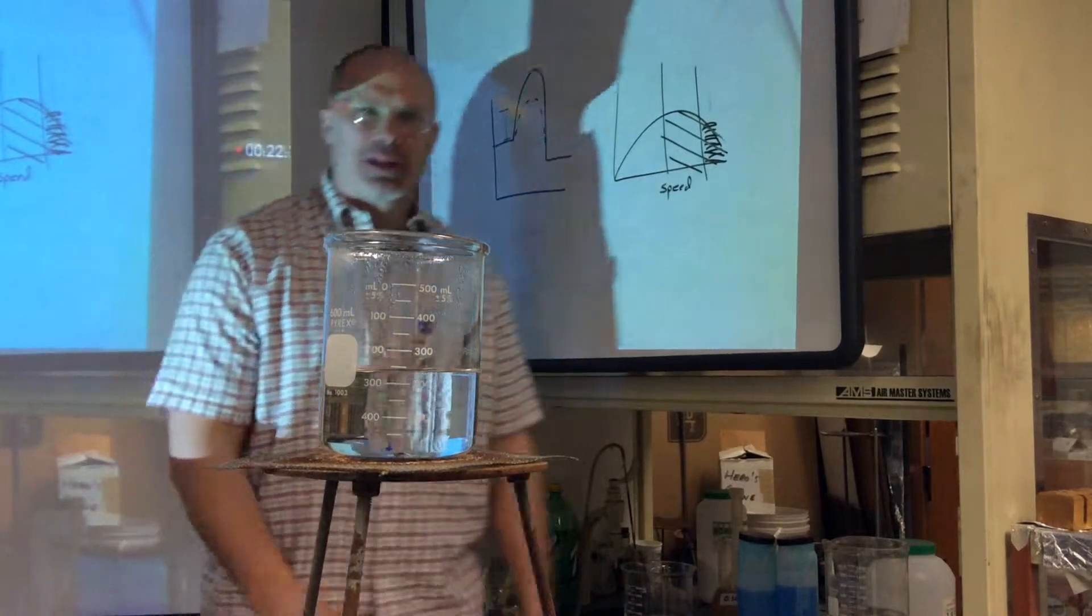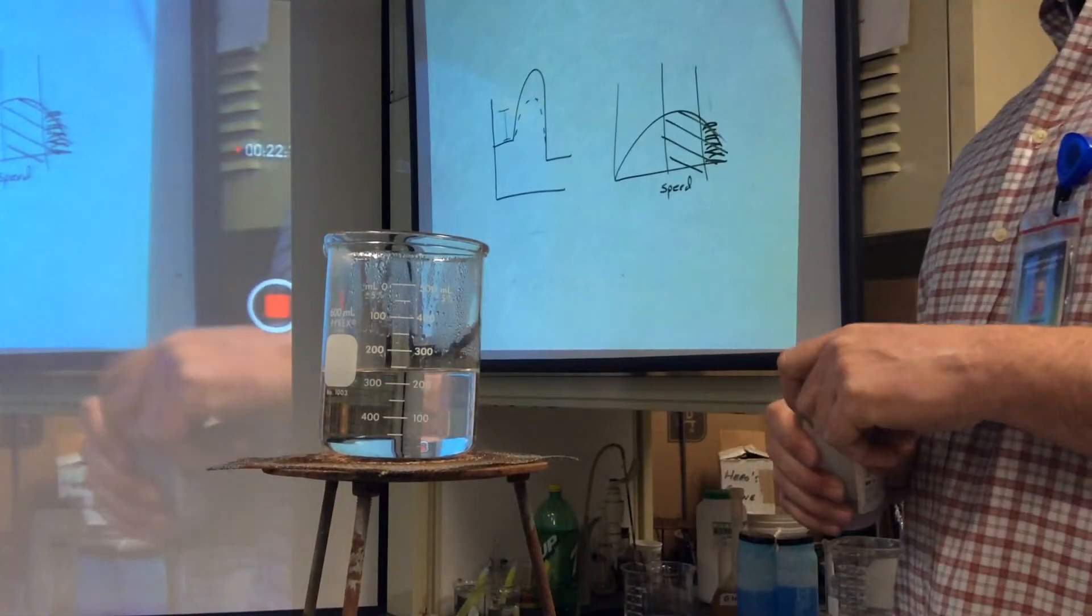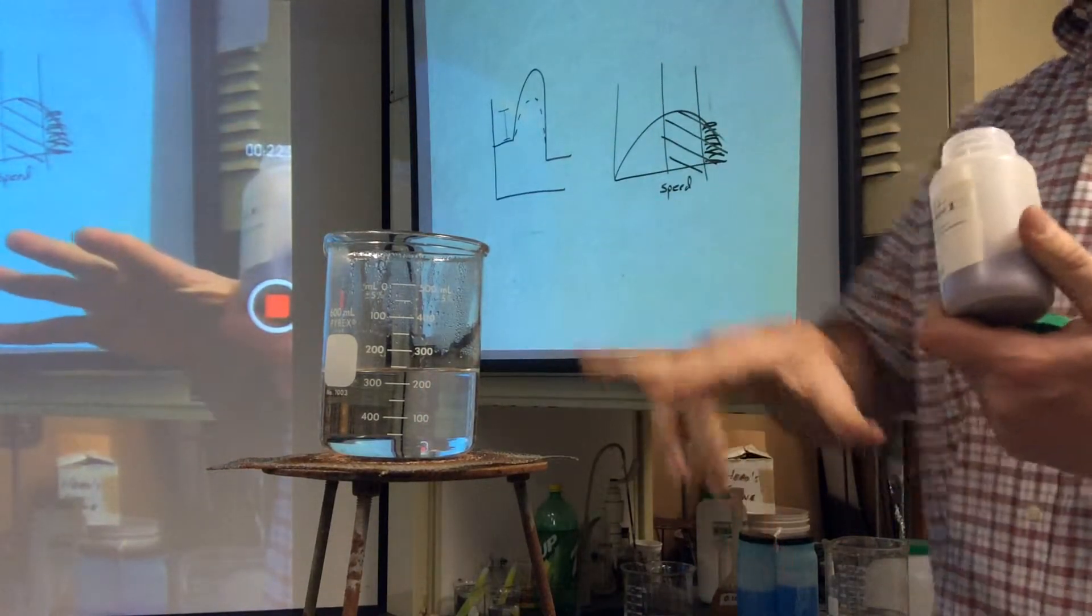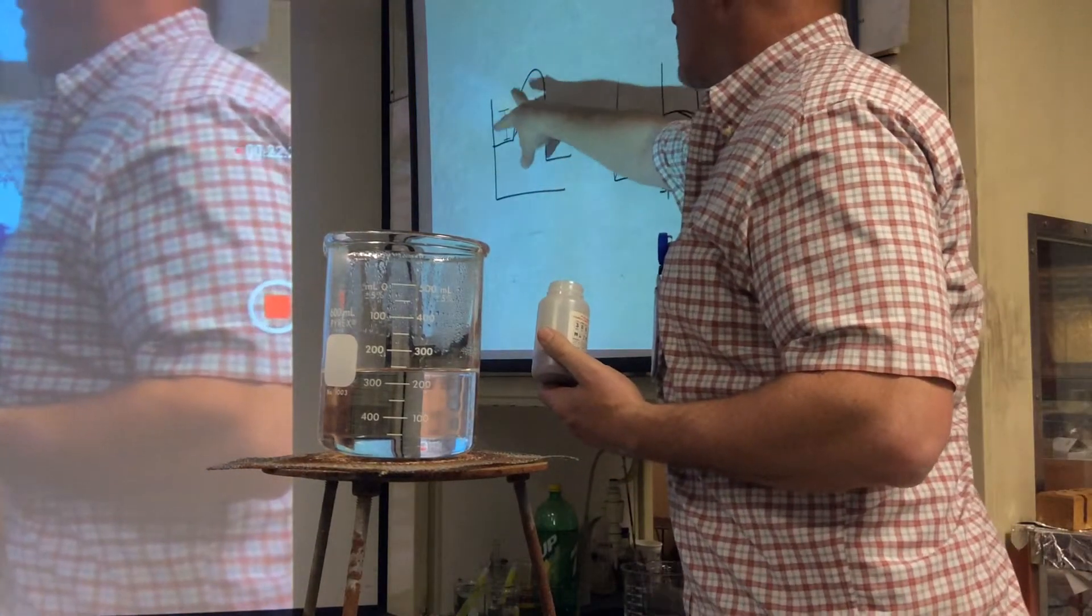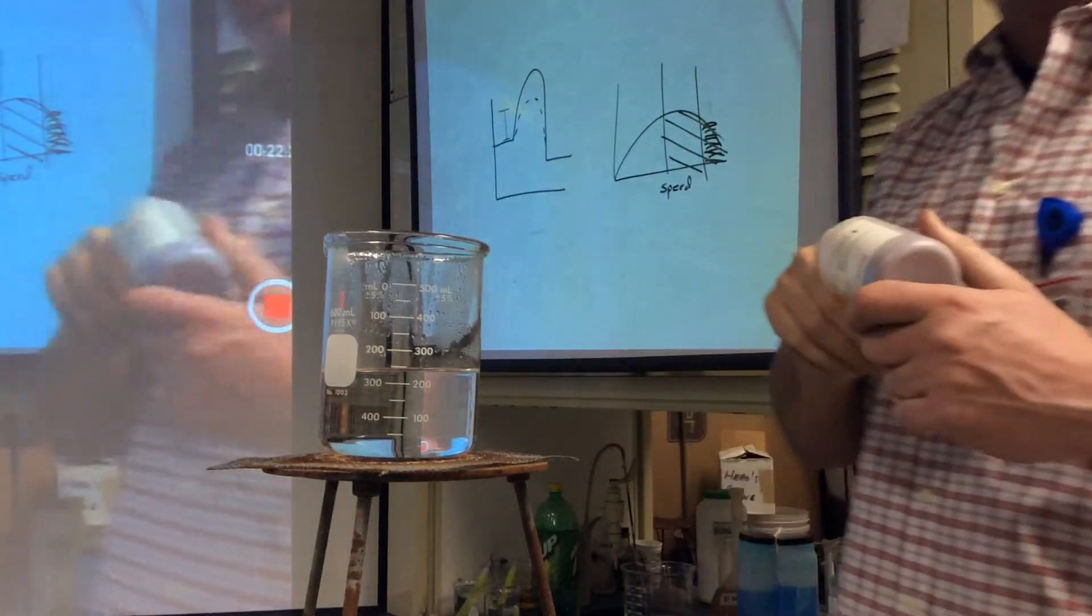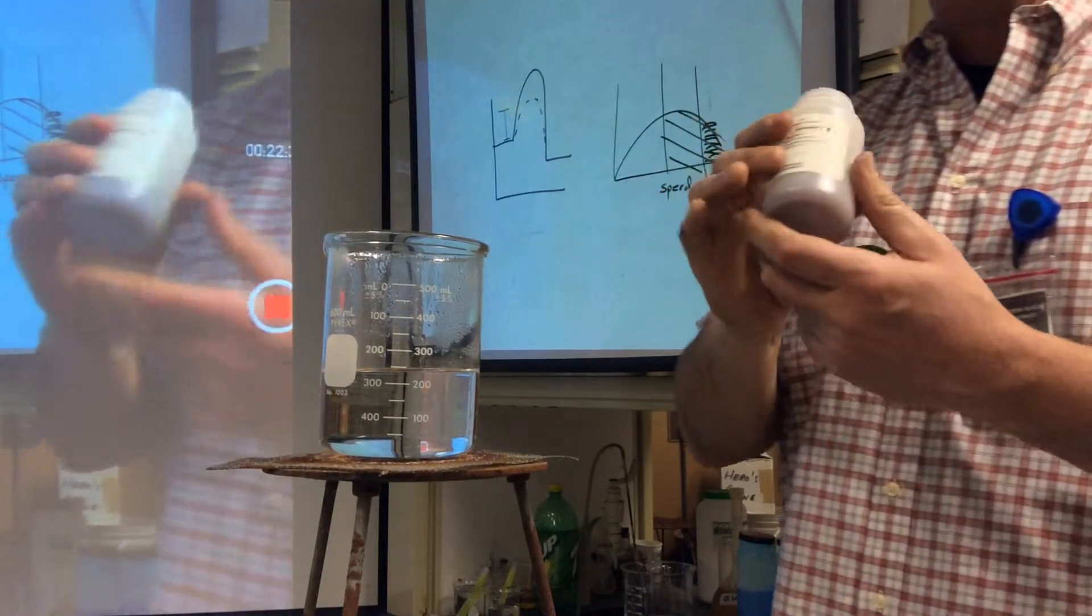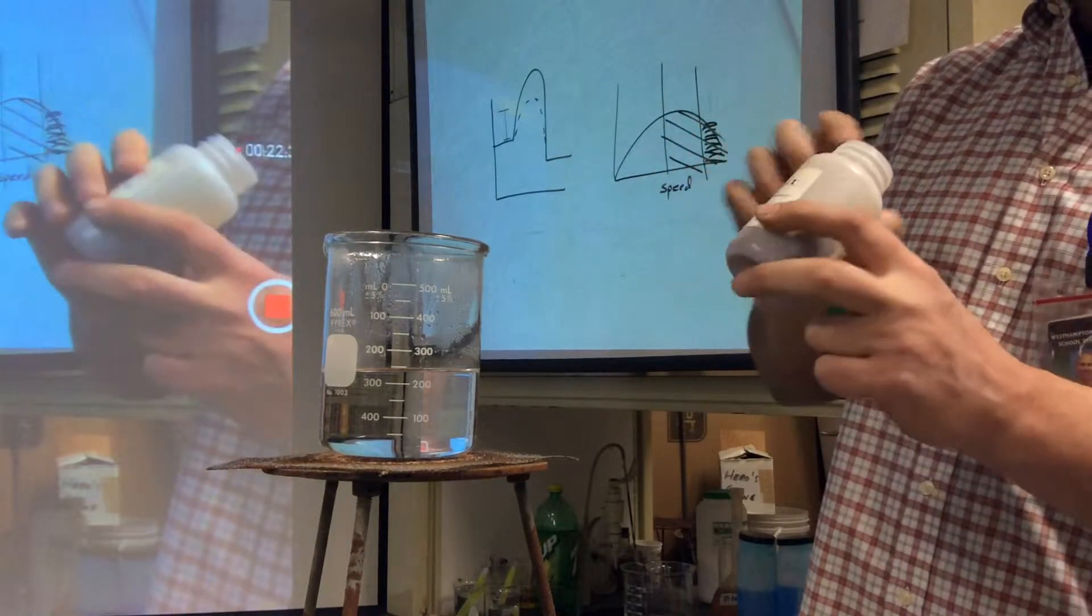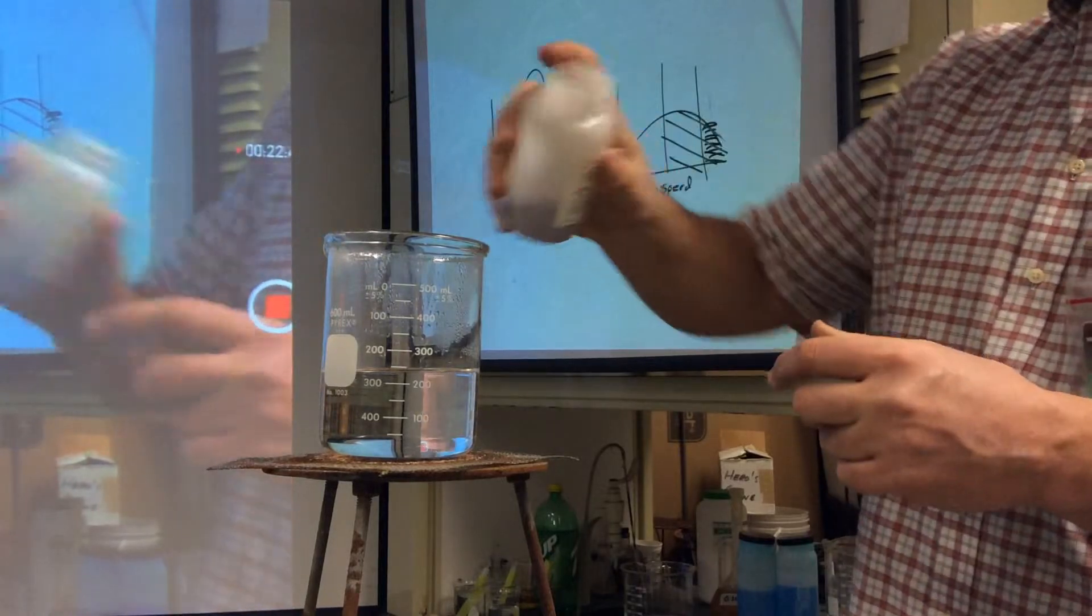So that's what we're doing here. This isn't doing much for me, so I'm going to add a catalyst. By lowering the activation energy, the molecules who don't have enough energy to ride the slide will have it now because I'm changing the pathway. So let's drop some cobalt chloride. We can know we have cobalt chloride because it's a nice colored salt—it's got a transition metal in it—so we can see when we have it. Here we go.